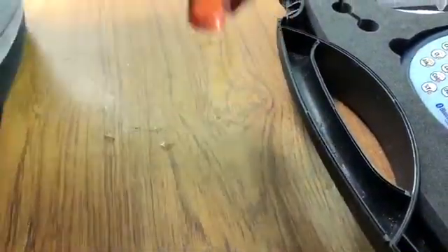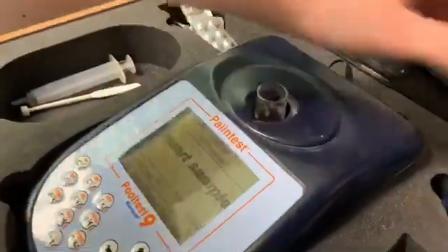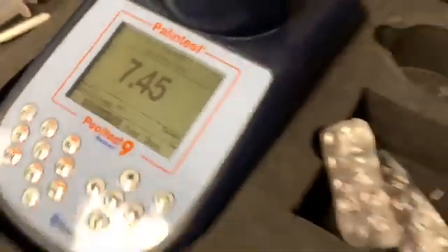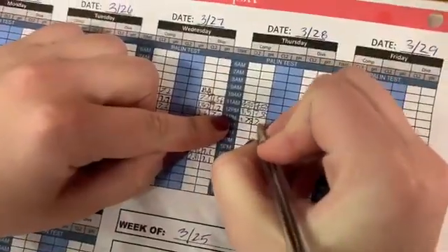After two minutes, you will mix it a final time before inserting it into the Palin test. Again, for our reading, we will copy it onto the correct time and pool.